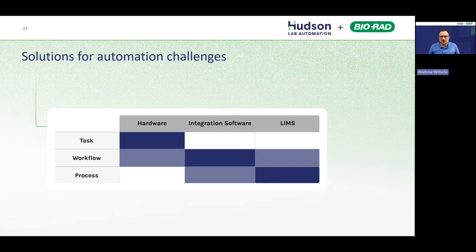Now, when we look at process automation, similarly, there are tools that are designed specifically for that. One of the main points of emphasis that I want to get across here is that when you look at automation scale across all these different scales, you have different tools that are appropriate for solving different problems, and you do not want to try to solve every problem with the same tool. That ultimately is a different pitfall, right?